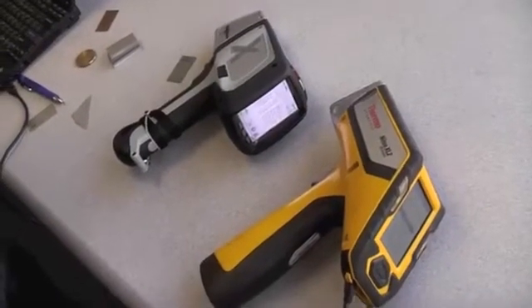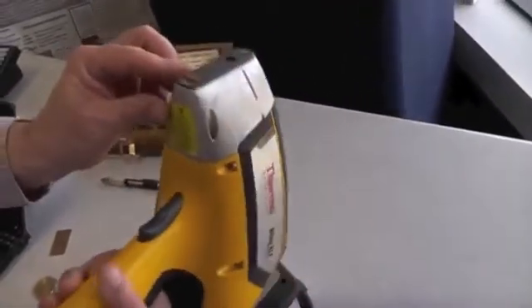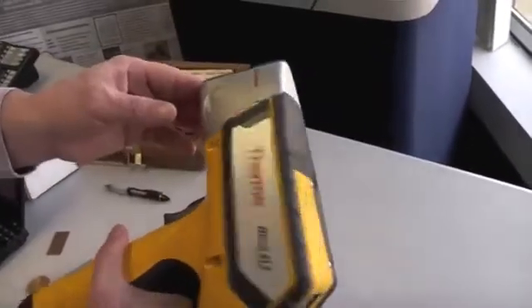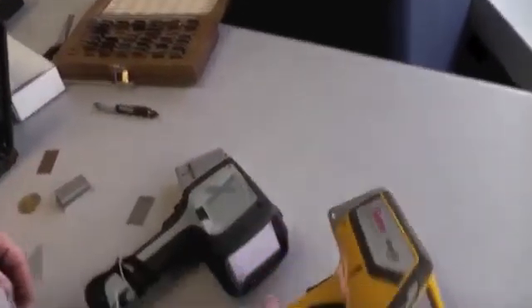The packaging is really not very sleek. It's a lot of halfway steps. The rubber bumper here is something that's really an easy thing to throw dirt at when you're talking to people that are doing plant PMI.